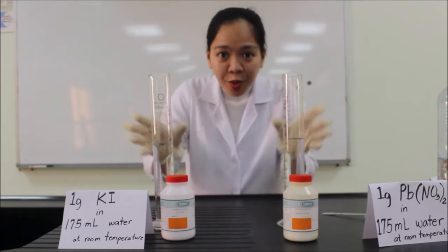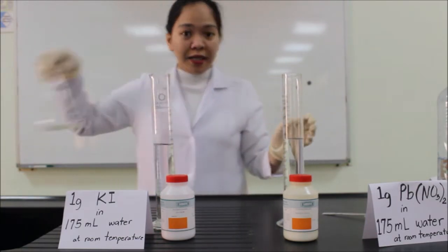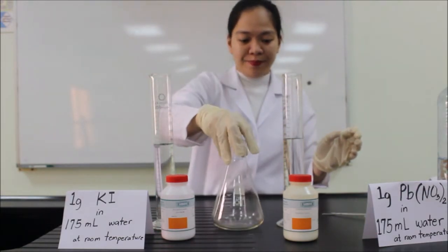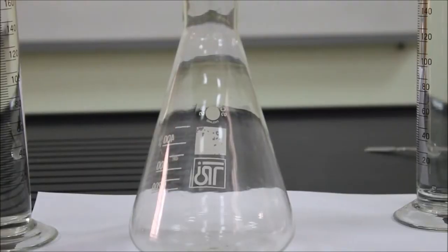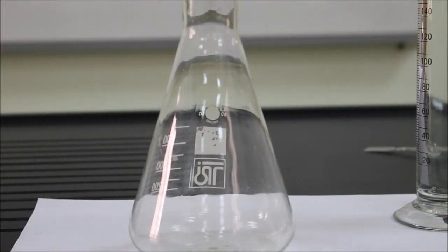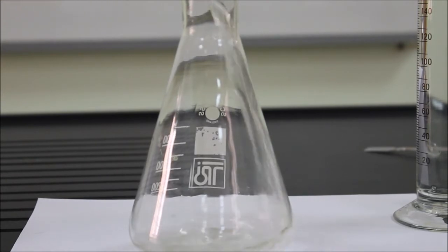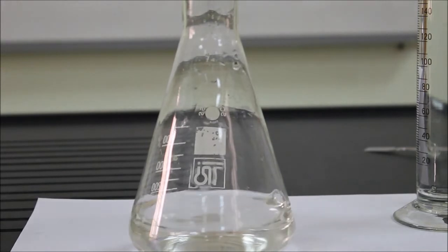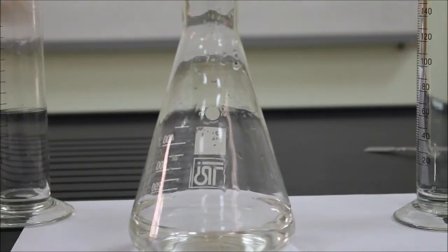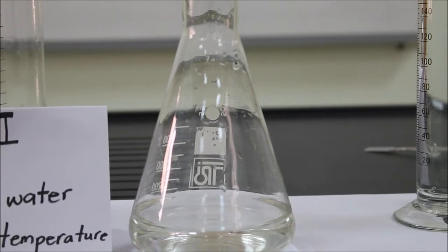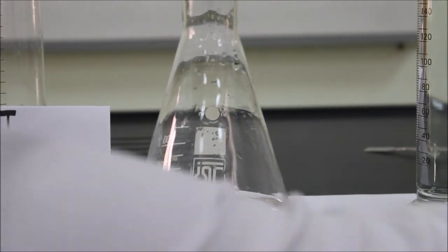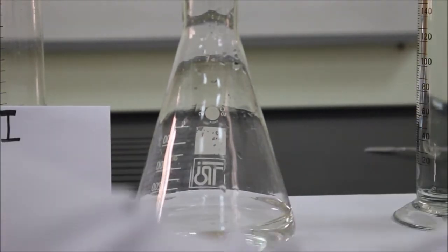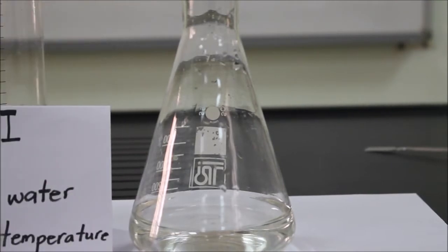Then we will combine this in a flask. So I'll start with the potassium iodide. I'll pour it all in the flask. And I will combine it with the lead nitrate. Watch what will happen.